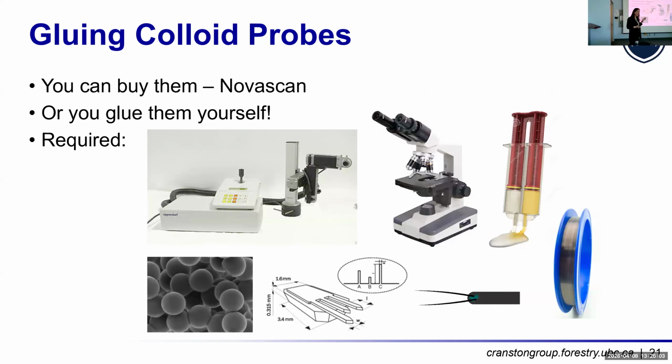So that's one reason I like it. You can buy colloid probes. Novascan sells them, or you can glue them yourself. And so we have the setup here, and this is something I did a lot during my postdoc. I would buy other people lunch if they would glue them for me because I wasn't that good at it.